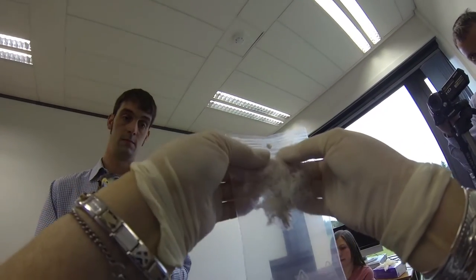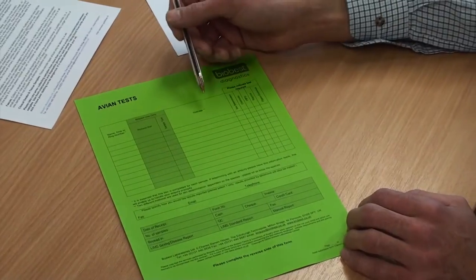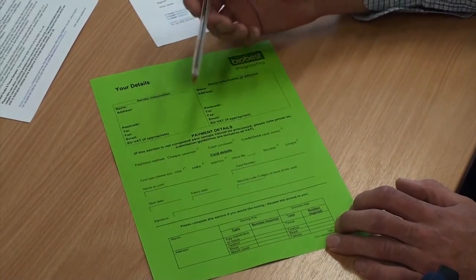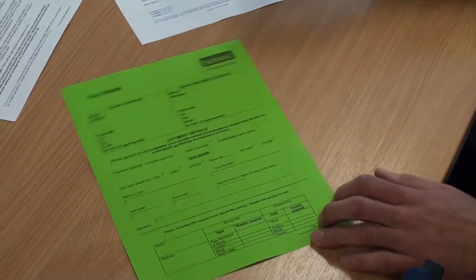Place the feathers in a small bag or sealed envelope. Complete the submission form in full, including bird reference, customer name, and contact details. Include payment as either cheque or cash, or fill in credit card details. We can also take payment over the phone if you prefer.